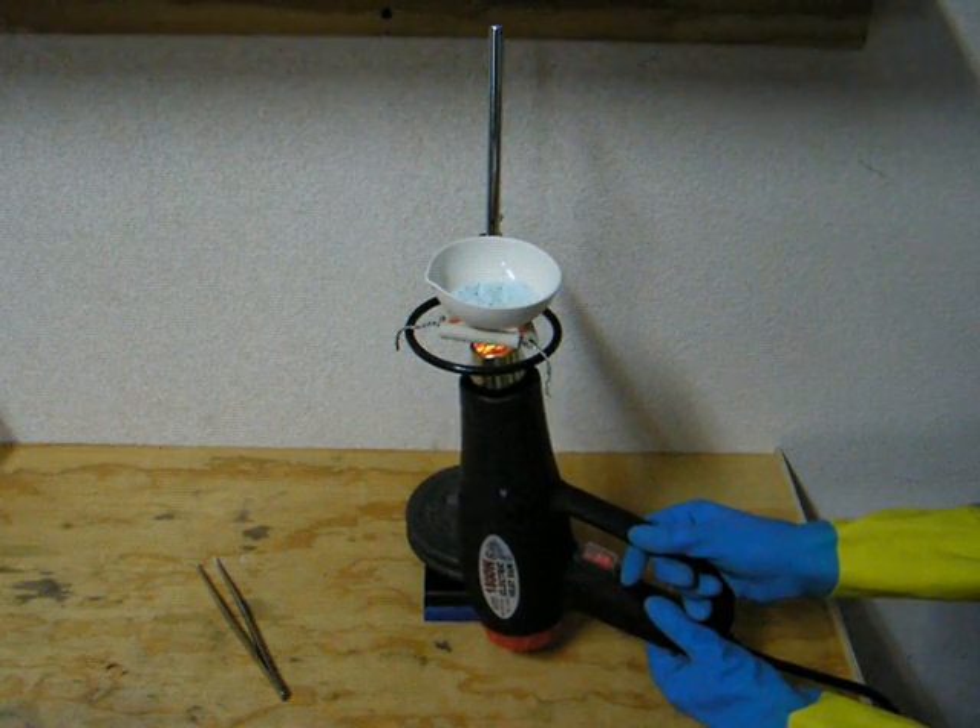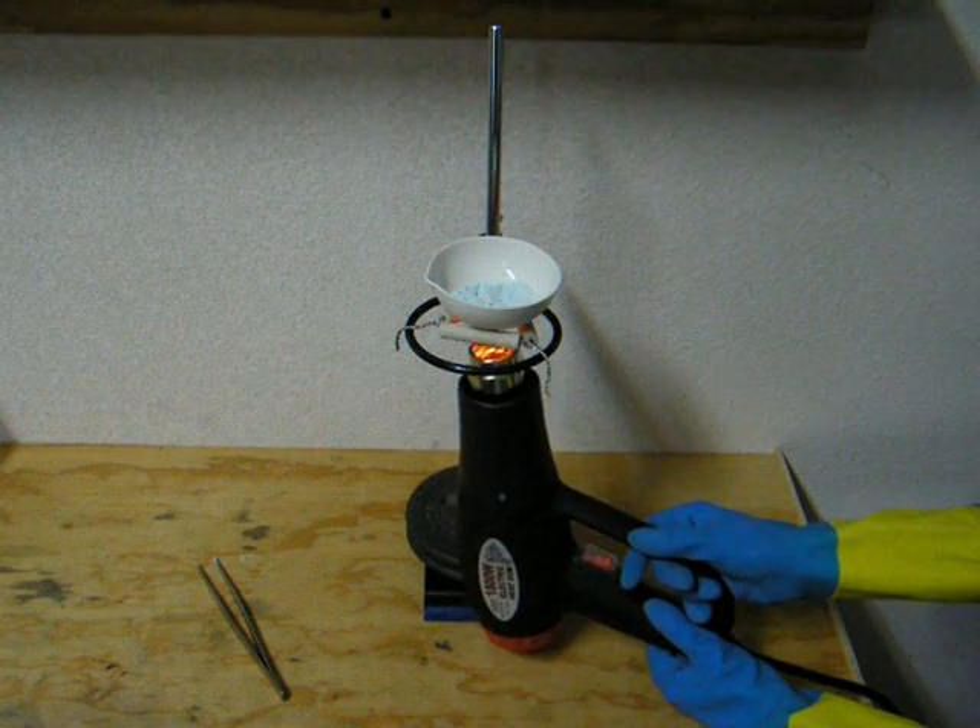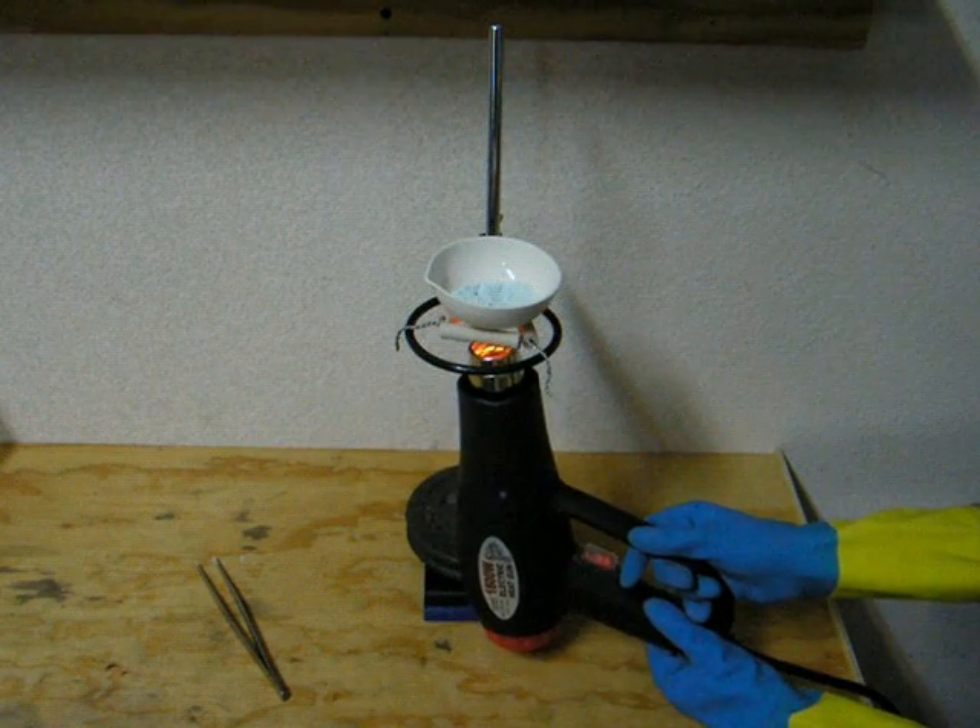Here we are towards the end of heating. You can see that the contents are almost white. When the copper sulfate is fully white, you are done heating.